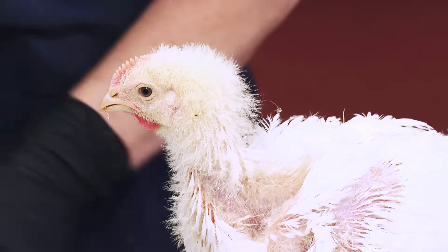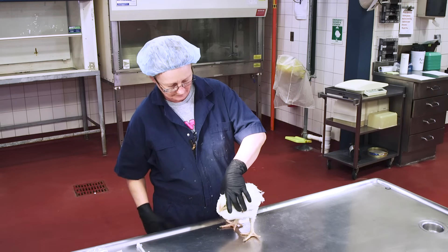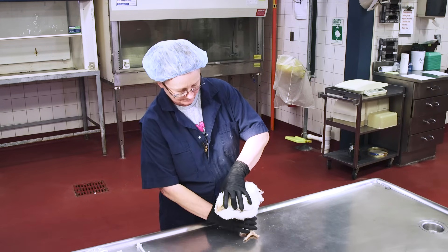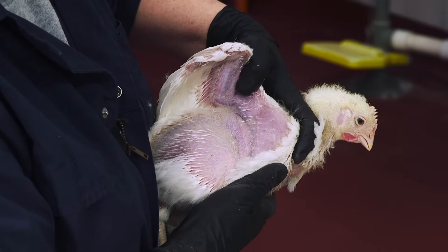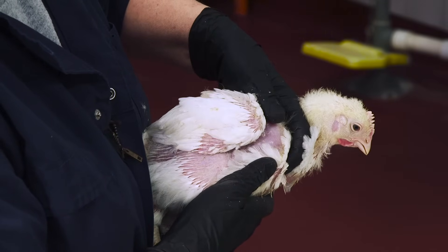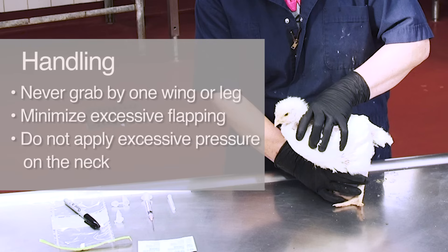Next, let's look at how one person can perform the procedure on their own. Here, we're using a broiler chicken that is about four weeks old. To initially pick up the bird, grasp it gently with two hands — one hand underneath the body restraining its legs between your fingers and supporting its breast, and the other hand coming over the top of the bird with a finger going under each wing to restrain and support the wing. It may struggle, so hold it closely to your body for several moments until it calms down. You should never grab a bird by one wing or one leg. Try to minimize excessive wing flapping, which can result in injury if the wing hits a solid object. Don't apply excessive pressure on the neck or keel, as this can be very stressful for the animal.